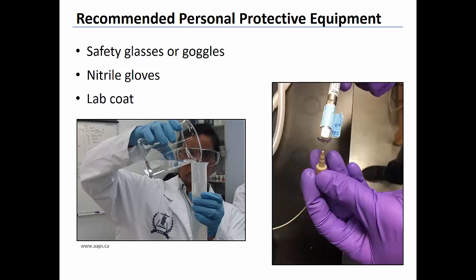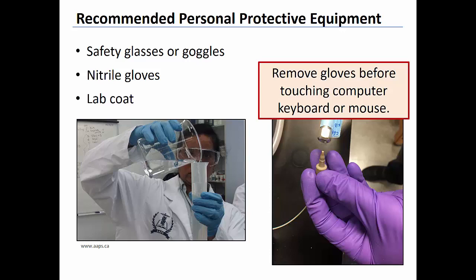Wearing gloves during these procedures protects your hands from the chemicals and minimizes the risk of contaminating the solvents or the column with oils and bacteria on your skin. Note, however, that gloves should be removed before using the computer keyboard or mouse.